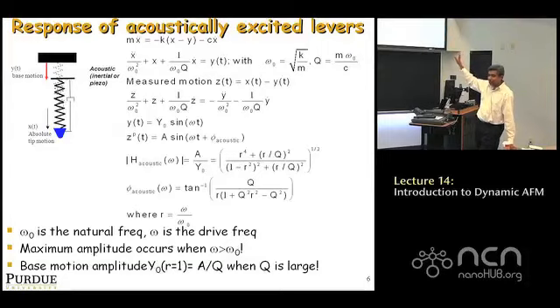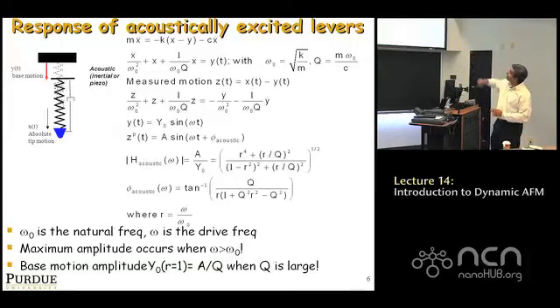So keep that in mind. There are actually two different models out there for damping. If you look at a classic paper by Ansikowski, he says that the ultimate damping in acoustic excitation consists of two parts. One is a dashpot between the base of the cantilever and the tip. Another is a dashpot between the tip and some fixed reference frame, okay? So this particular model, the equation I've written out, the damping is really a dashpot between the tip and some fixed reference, not between the base of the cantilever as shown in this picture. But we can quibble about it. Don't worry about it. You'll get a slightly different answer. In fact, it's probably going to be on your homework problem, okay?